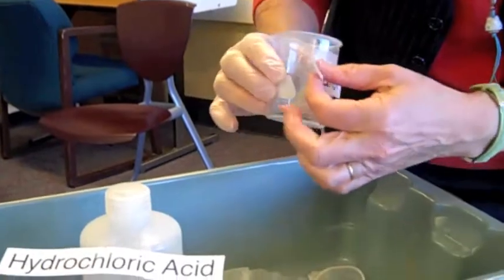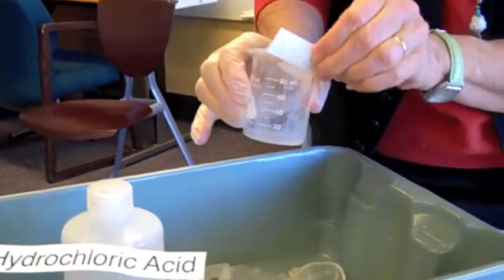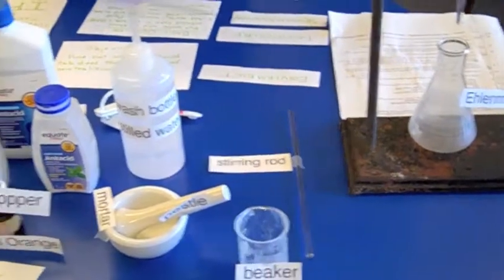This is a beaker, and it's marked in little gradations also. You want approximately 60 mils, a little less, 50, 60. And you are also going to want a funnel.